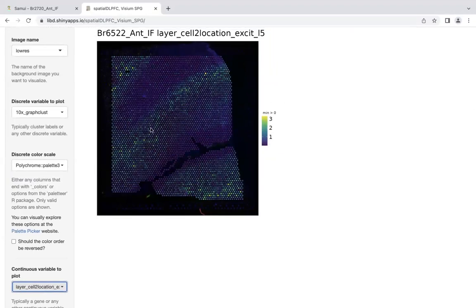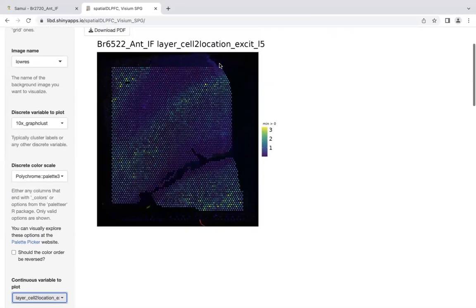In this case, this band right here is actually marking layer-5. So it's an interesting pattern here.